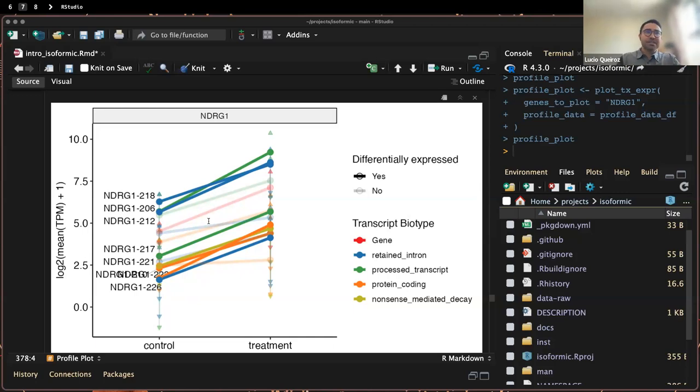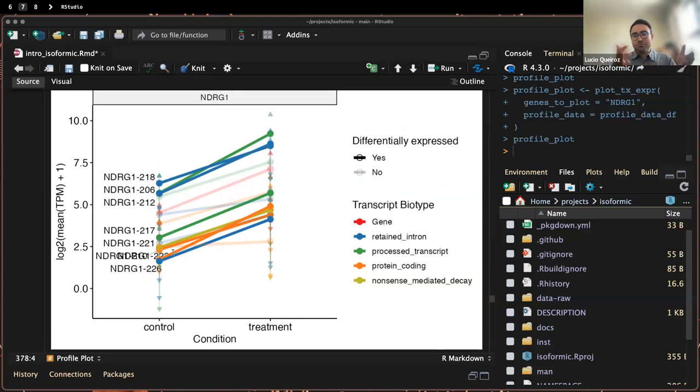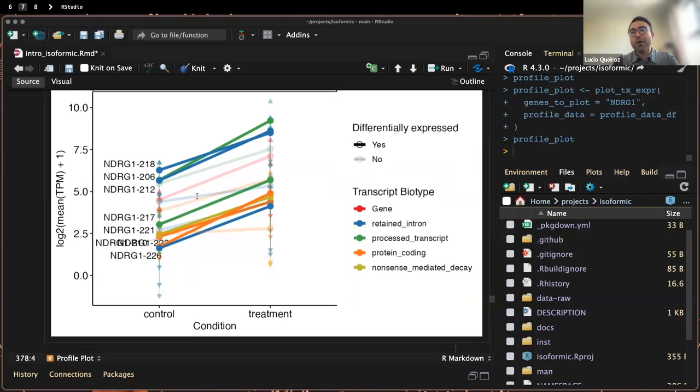And then you could always explore, trying to do a mapping and see if, in the genomic context, you have different coverage on intron sites or boundaries of exons. But this is something that the quasi-mapping approaches do really well, which is distinguish transcripts without the knowledge that those transcripts come from the same region. They just see if the two RNA sequences that I read would match better to one or the other, without really knowing that they are the same exon or so.